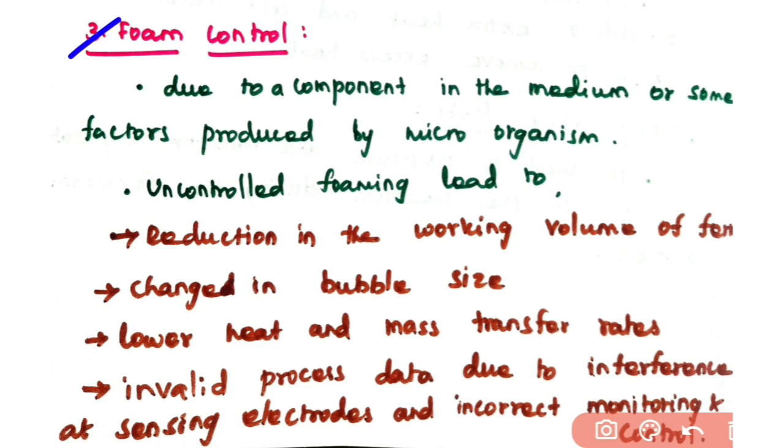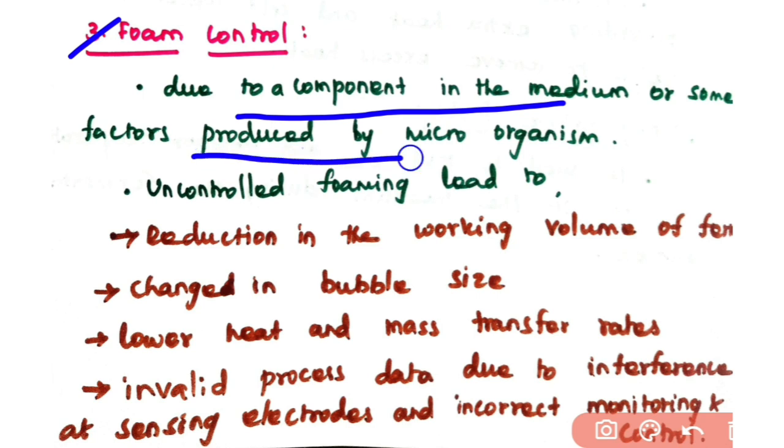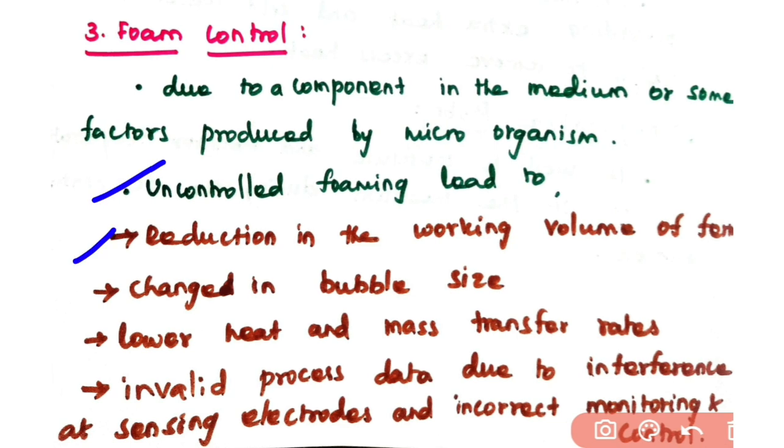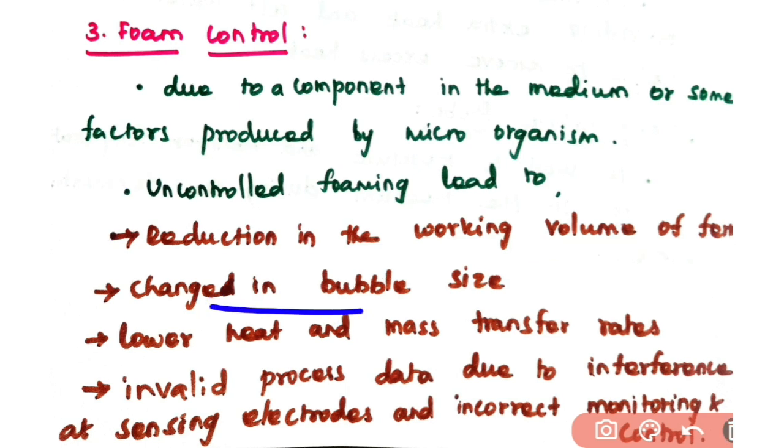So this foaming occurs due to some component present in your medium or some factors produced by a microorganism during your fermentation process. It is very important to control the foaming, or otherwise it will lead to some danger. That is, it may affect some physical and biological factors of your process. The physical factors include reduction in the working volume of the fermenter, changes in bubble size, lower heat and mass transfer rate, then there will be invalid process data due to deposition of this foam on sensor devices.